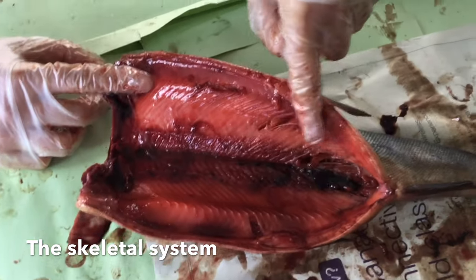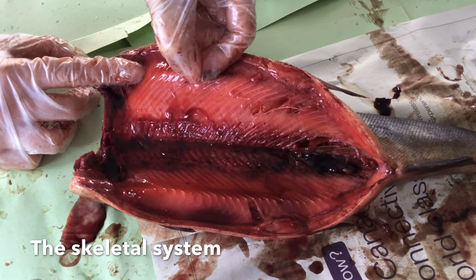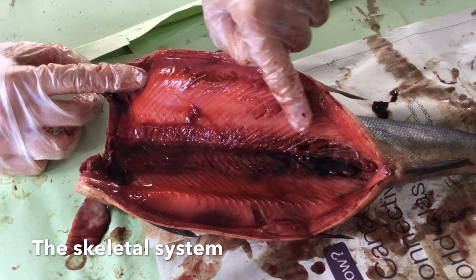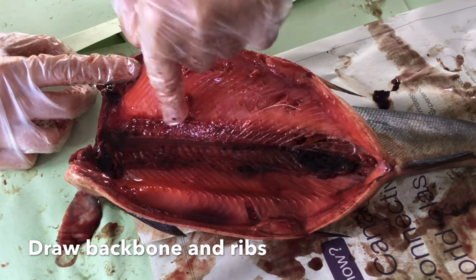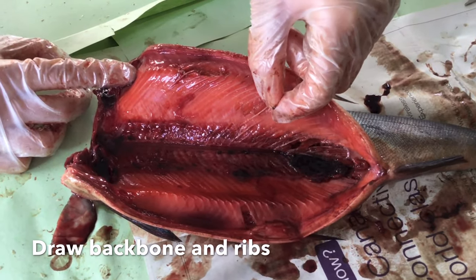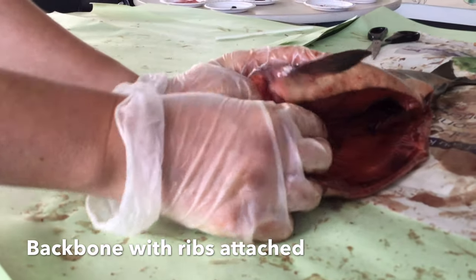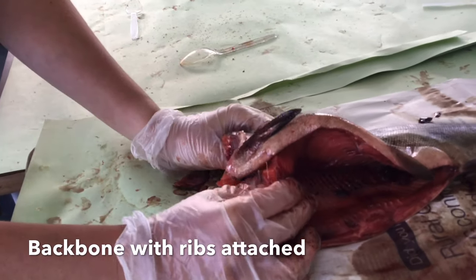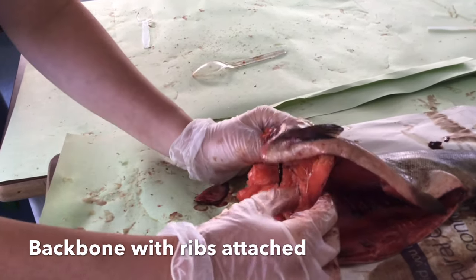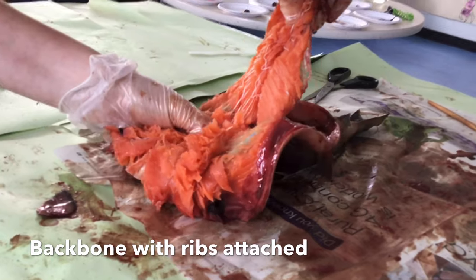And Alicia is holding it open right now. I would like you to now do the diagram of the backbone. Just draw the backbone and the ribs in the space provided. We are going to pull the entire backbone with ribs attached as best we can. We are going to pull the skeletal system right out of the salmon. And then we can maybe get a better look at the actual backbone and its. Oh, there it comes.